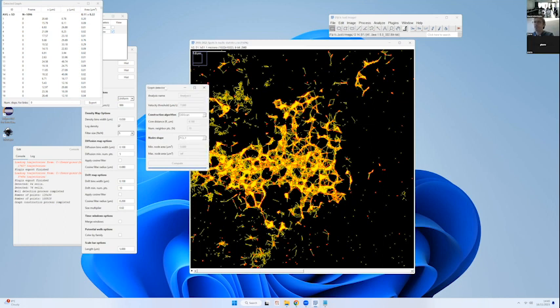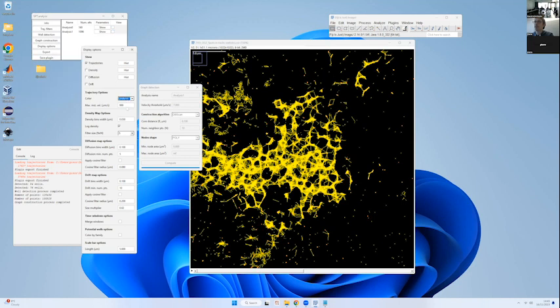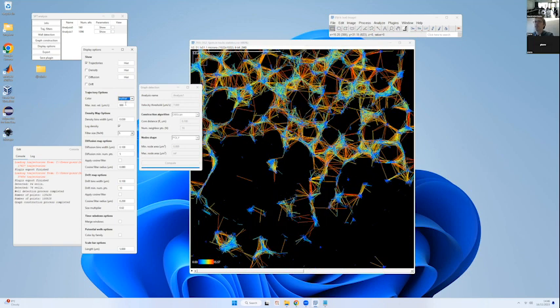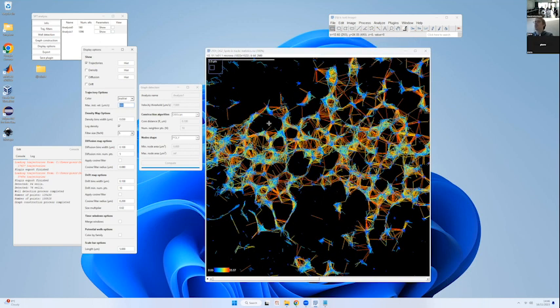We have a question: how do you go back from the instantaneous velocity? How do you know at which position what the instantaneous velocity is? Can you click on something? For example, I want to go on the image, choose a region, and know the velocity of a given region. No, you cannot know what the velocity of a region is. What you can do is remove displacements that are faster than a threshold that you specify. So you cannot do that at the moment.